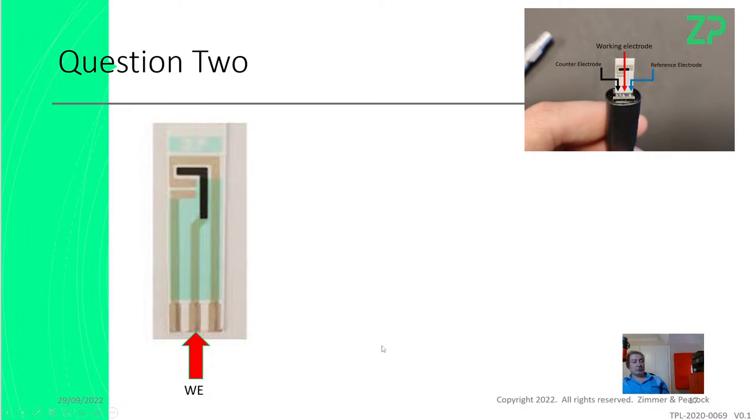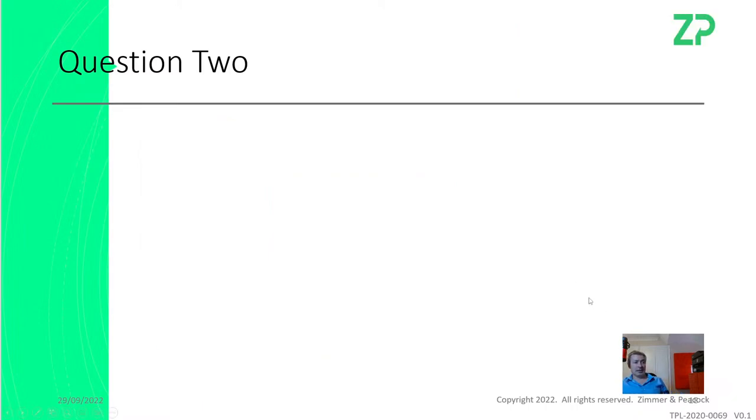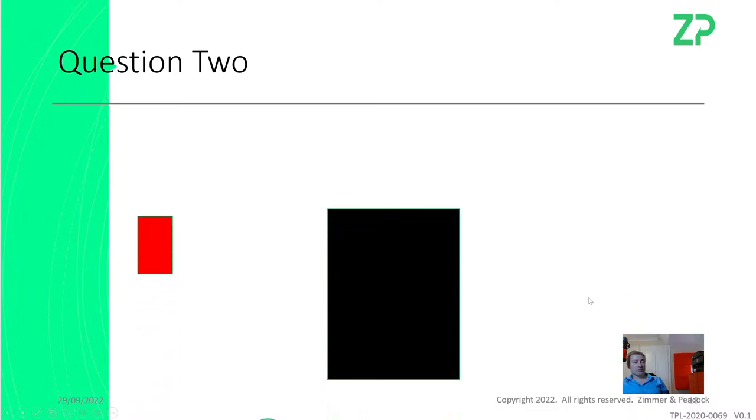So traditionally, we tell people to use the working electrode in the middle. That's the reference, that's the counter. You've noticed that shifting these around actually makes no difference. And people have traditionally said in the literature, you need a large counter, which I've indicated in black here, and a small working electrode. But you can see that we can have a relatively larger working than counter, and it still works. And when you look at some of the other vendors on the market, they also have a larger working than counter. So the question is, why is this?